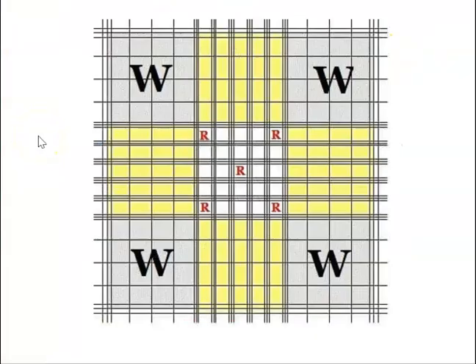So just for reference, let's look back at our grid pattern. The volume for this entire white blood cell counting square is 0.1 millimeters cubed or microliters. Each one of these 9 large squares is 0.1 millimeters cubed.